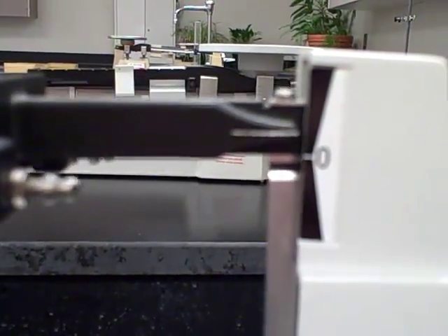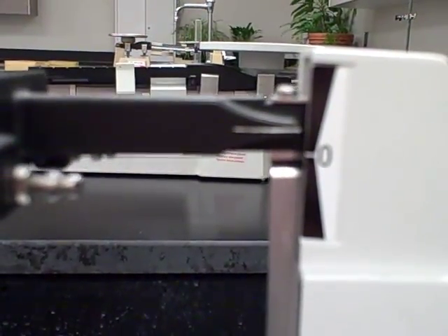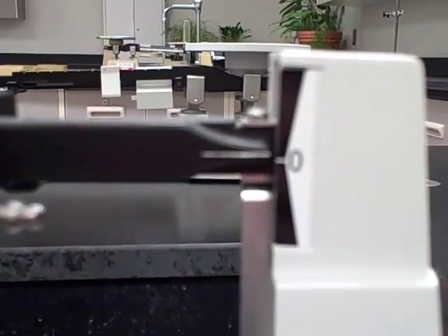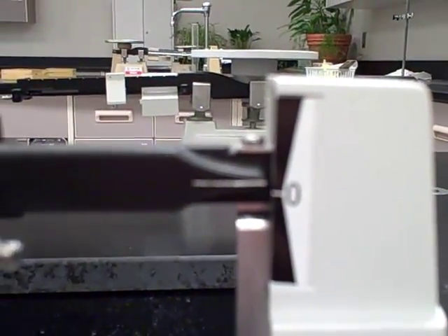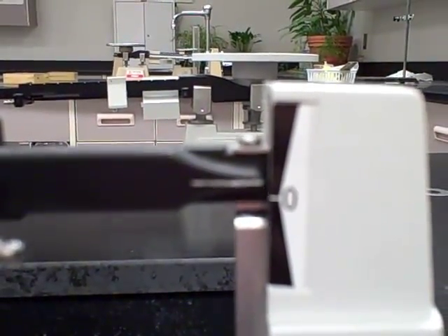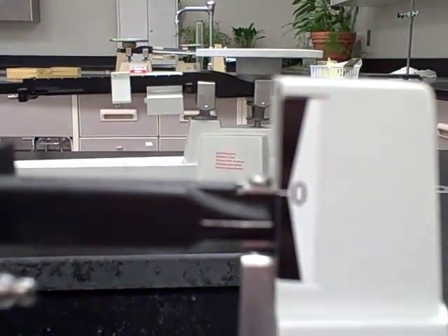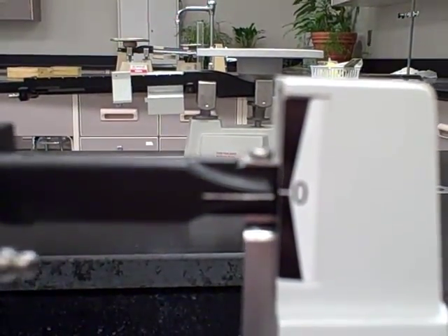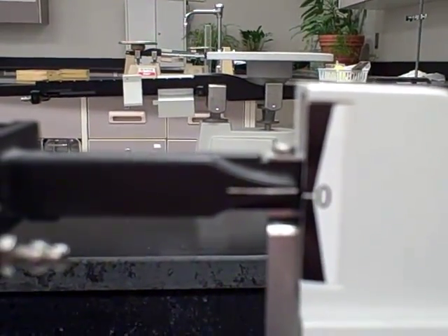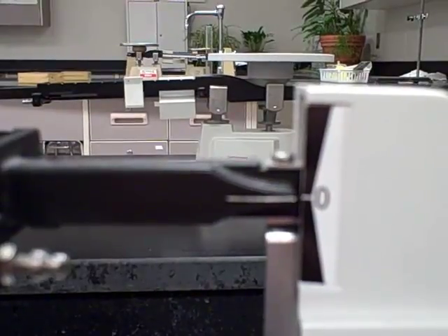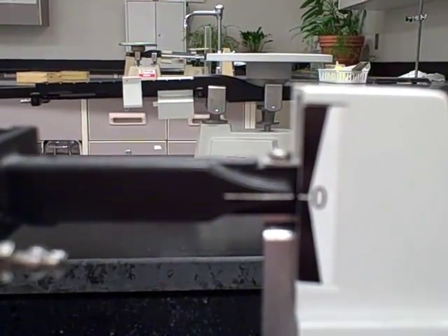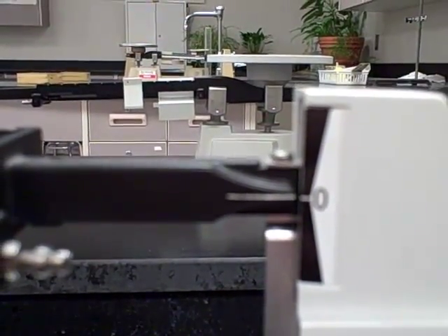That calibration knob on the left side of the balance is all you need to adjust once you've set your riders to the zero position. Once you're set, you can then place your masses on top of the pan.